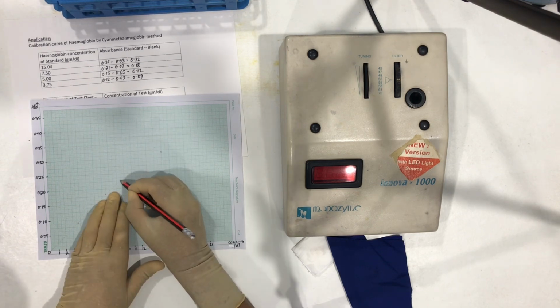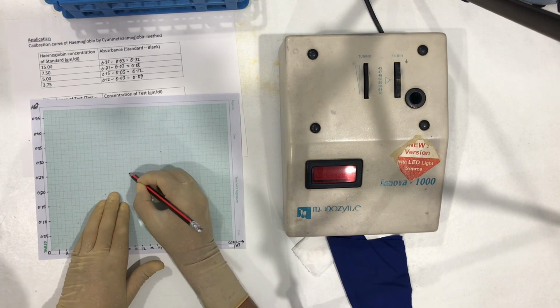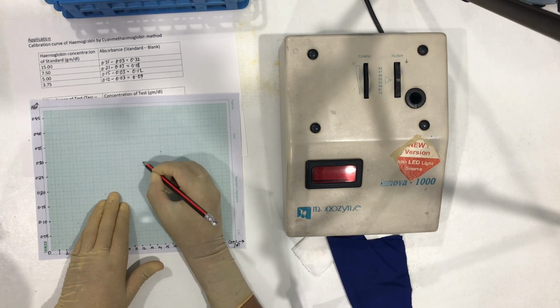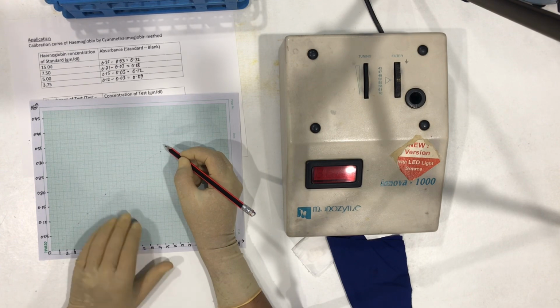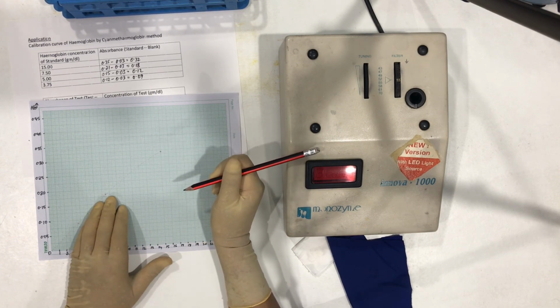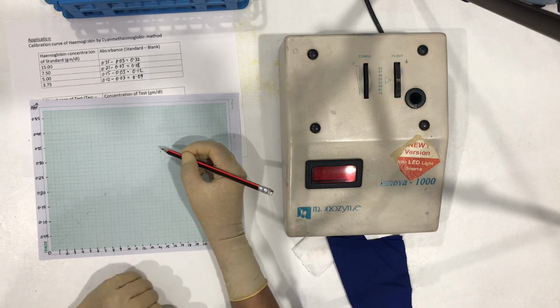The line is slowly bending out here, which means it is slowly becoming non-linear. This is also because of the photometer which I am using is a very old one, but still it is giving a good curve.